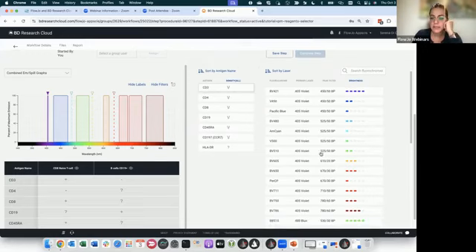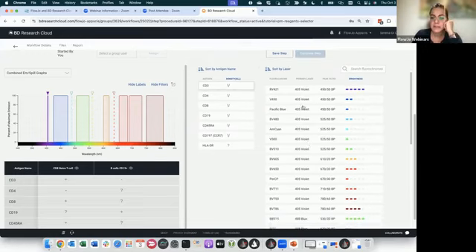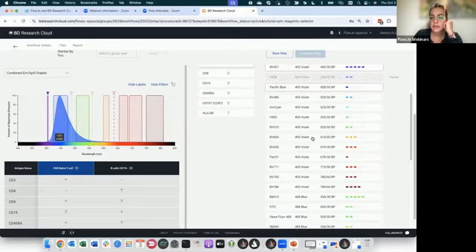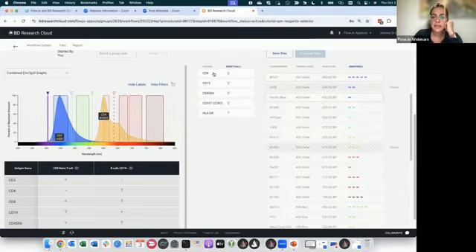So eventually I can use a mid one, this one, and you start pairing, and you see that the spectrum starts to fill in. So I can pick, I don't know, this one, okay.